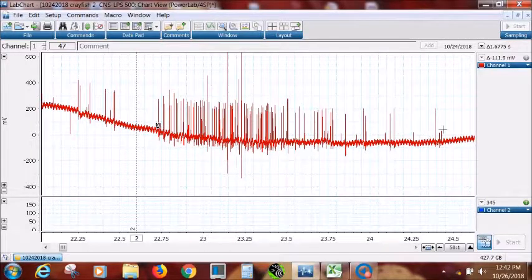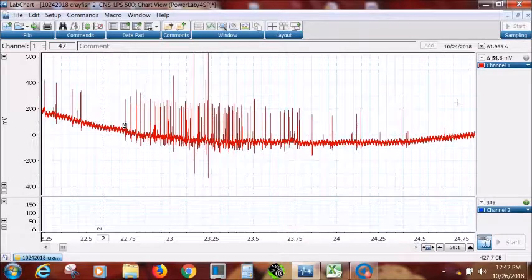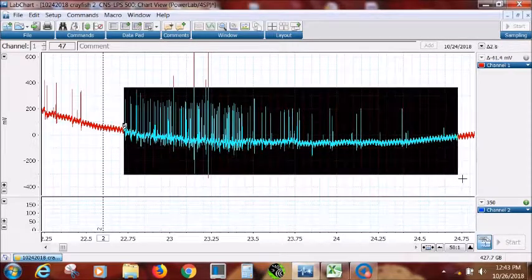And let's see how far we're going to go. We're going to go all the way over here. Let's stretch this out a little bit then so we have it on our same window. There would be 2 seconds about right there. We know there's no other spikes, so we don't have to be too worried about getting out there. You could either highlight it again if you want to, close enough, and go to 2 seconds.